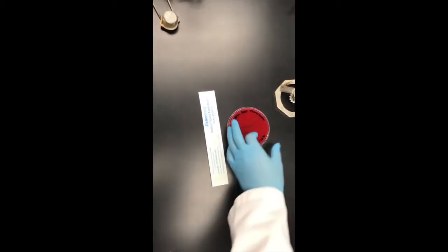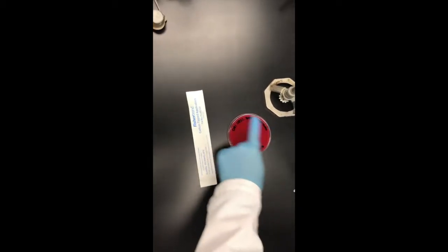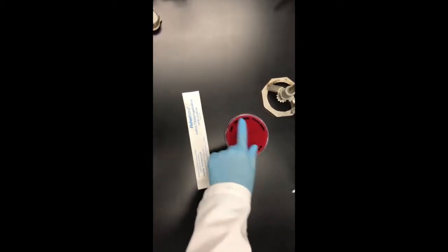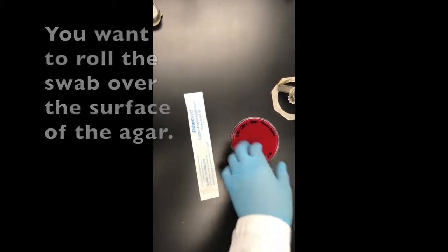And what you're going to do is you're going to run the swab on about a third of the plate and then you're going to use a loop to spread the rest of it out.